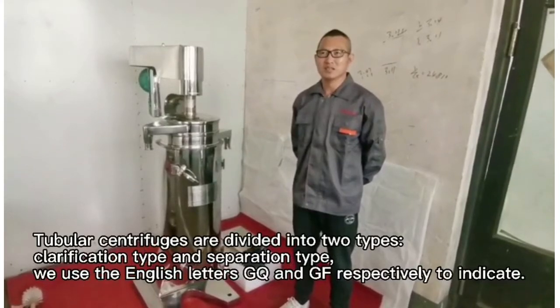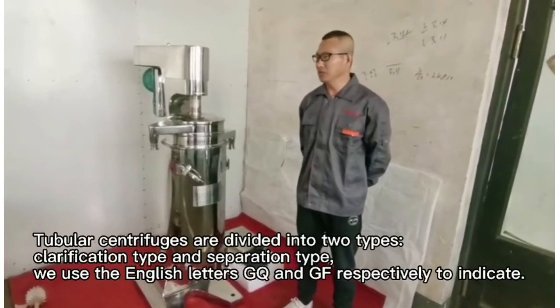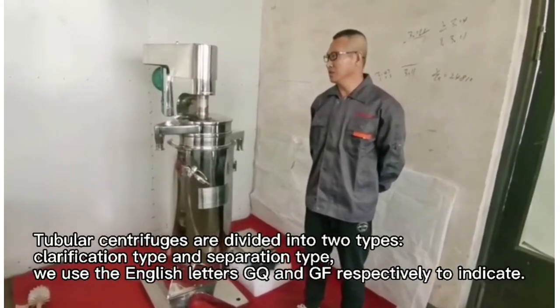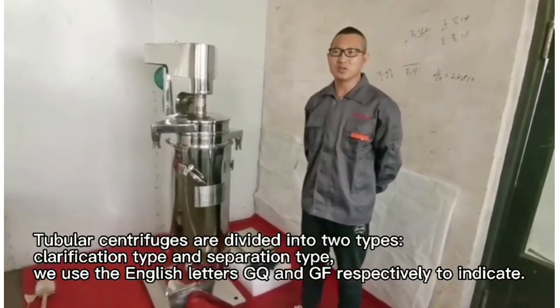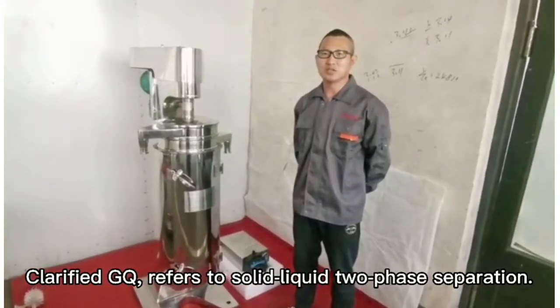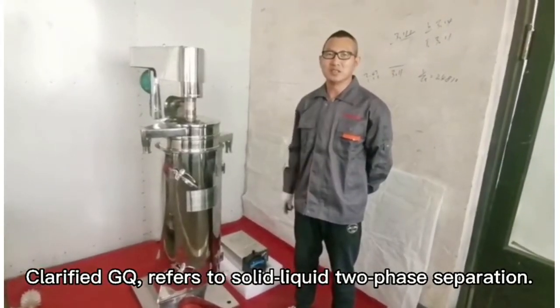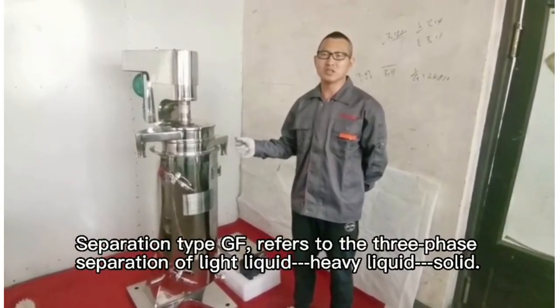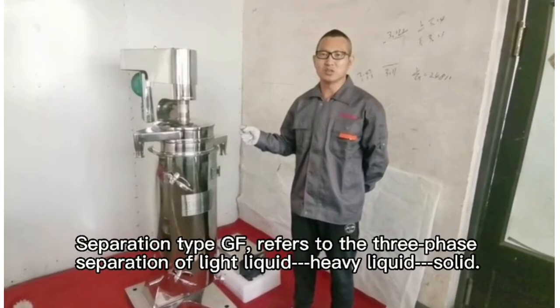Tubular centrifuges are divided into two types: clarification type and separation type. We use the English letters GQ and GF respectively to indicate. Clarified GQ refers to solid-liquid two-phase separation. Separation type GF refers to the three-phase separation of light liquid, heavy liquid, and solid.